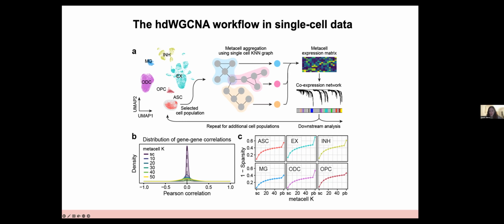Yes, that's correct. The metacells, you can see that there's this overlap between these two in this cartoon, and that is intentional. The metacells do have a tolerance to share. You can actually provide that parameter as the user. Like if you say, I want to combine 25 cells together into a metacell, and I only want at most 5 cells to overlap, something like that.